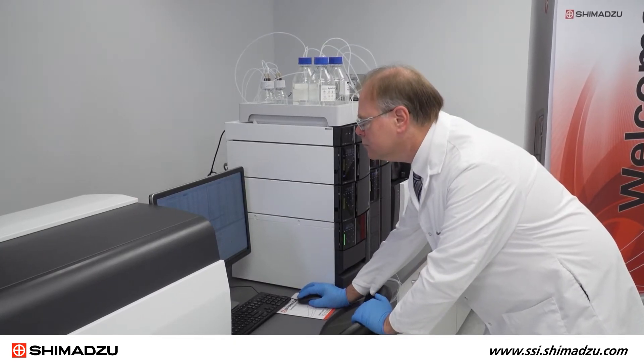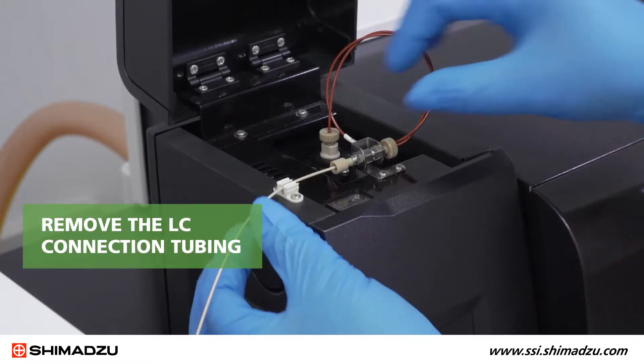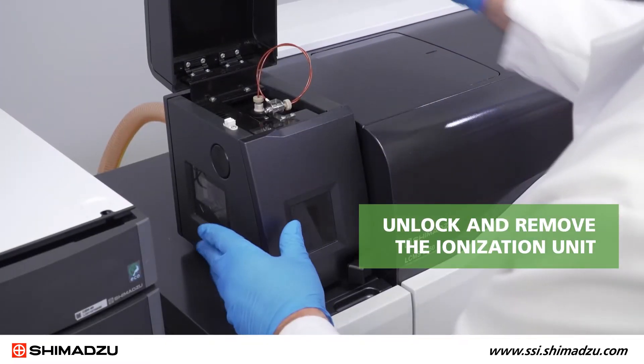After turning off all gas flows and heaters in the lab solutions software, remove the LC connection tubing. Then unlock and remove the ionization unit.